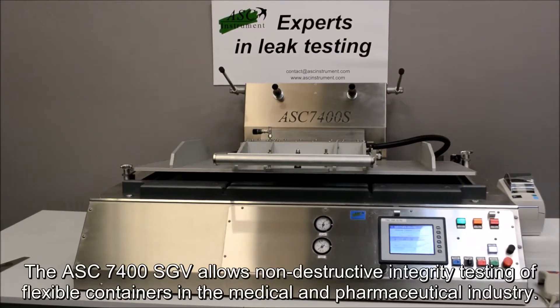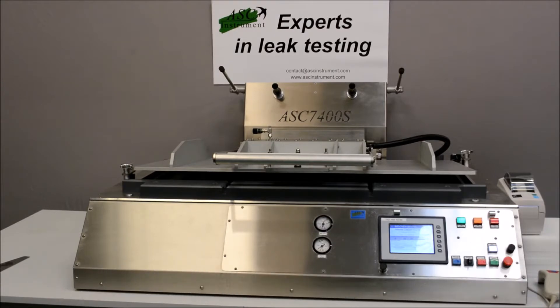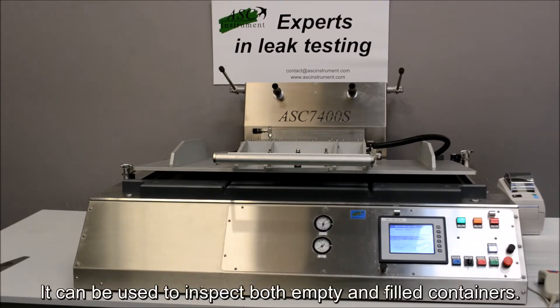The ASC 7400SGV allows non-destructive integrity testing of flexible containers in the medical and pharmaceutical industry. It can be used to inspect both empty and filled containers.